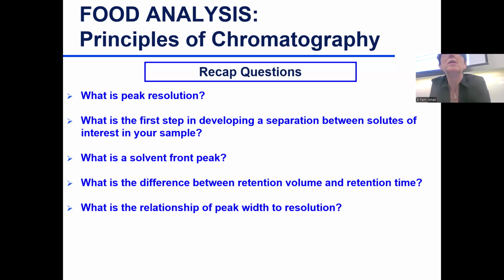Okay, so what are we asking? The retention of your solute. Yeah, on the column, on the stationary phase. So when we say retention volume, we mean the volume of the mobile phase it took to get that solute out. Did it take 10 milliliters? Did it take 20 milliliters to get that solute off of the column from the time of injection?